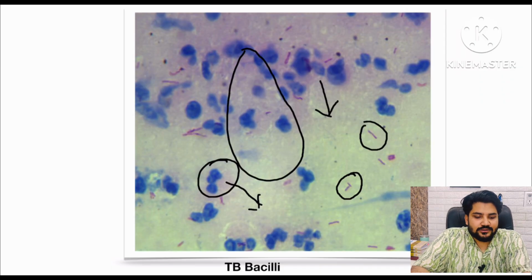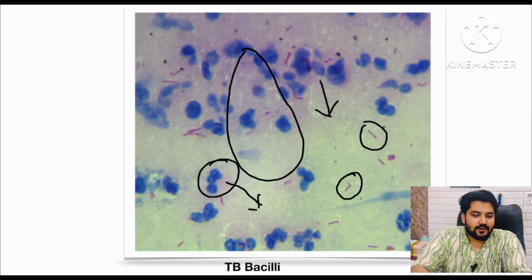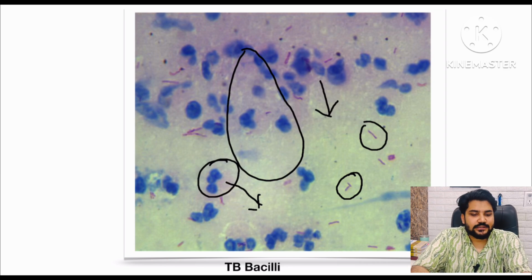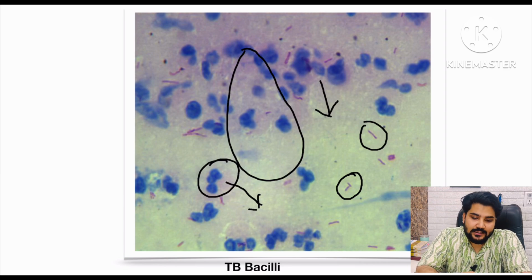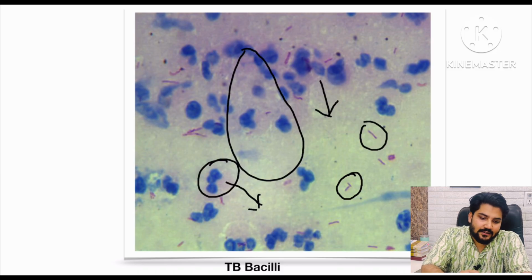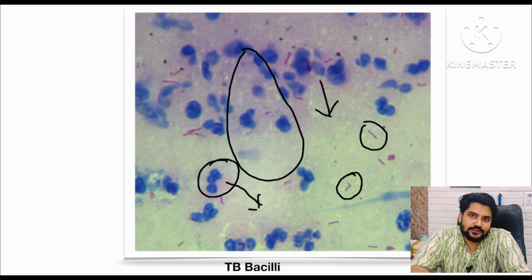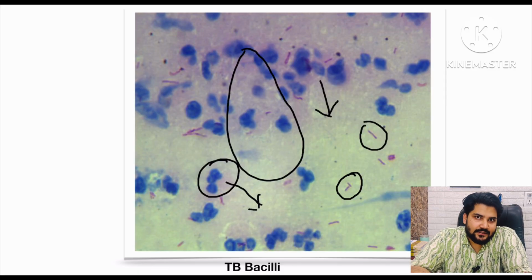Okay, so this is the complete picture of your microscope. So under oil immersion, what you are going to see, you are going to see this one. So look at that, these are the blue background and these are your red thin bacilli. So how we pronounce it, we pronounce it as red thin beaded bacilli.